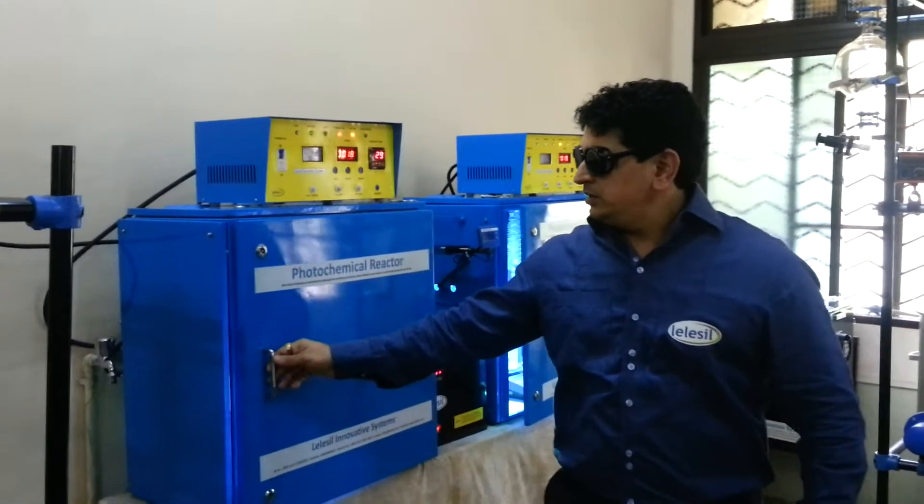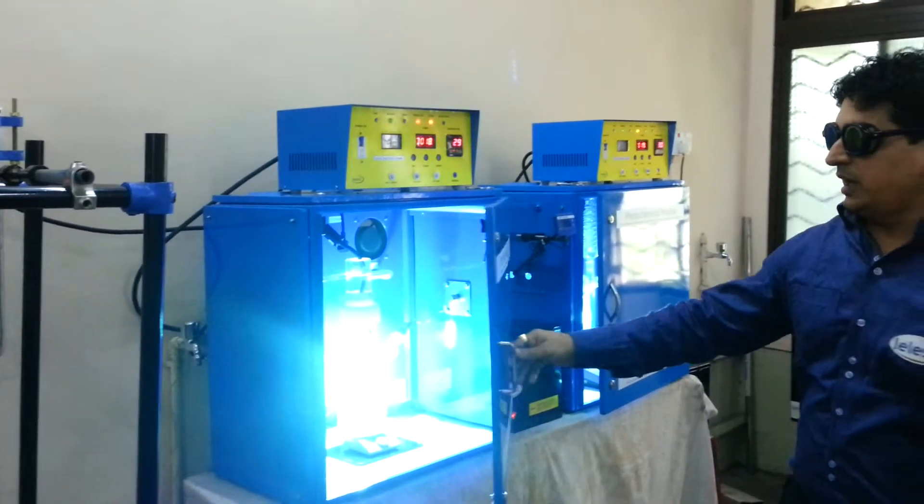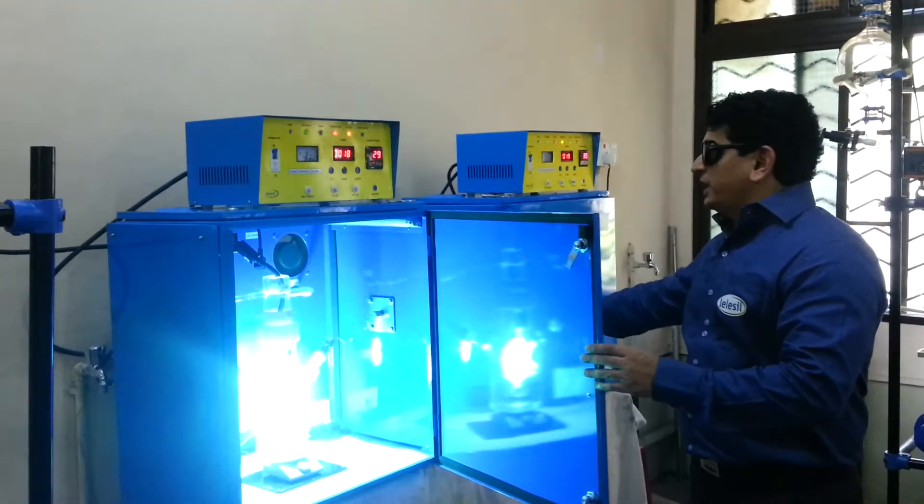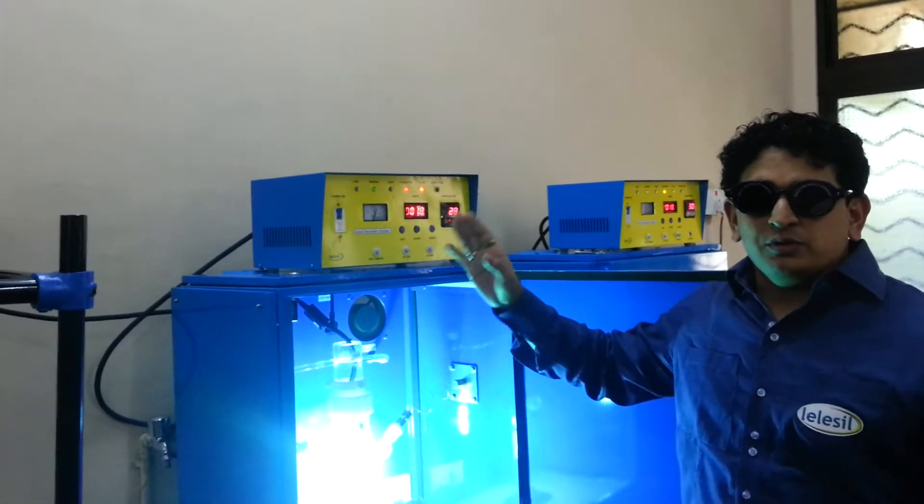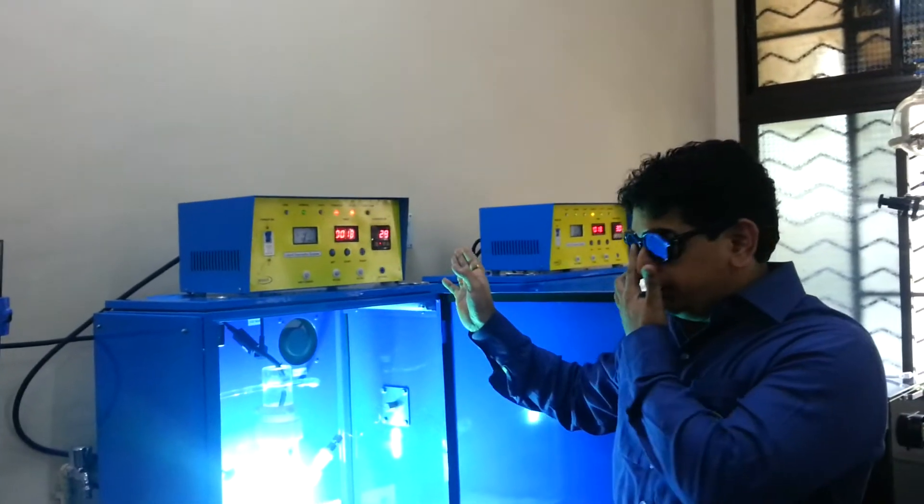Superthread adoption. I will just explain the facts. What you see here is a digital controller which will control both wattage lamps, 250 or 450 watt as required by the user.